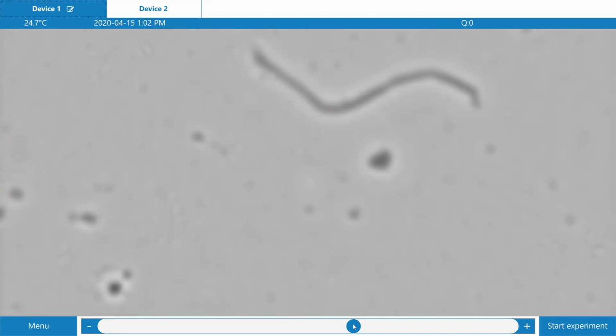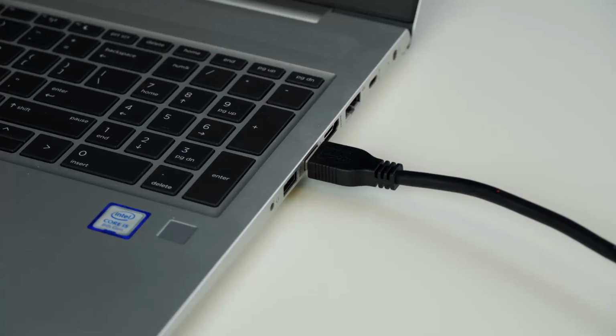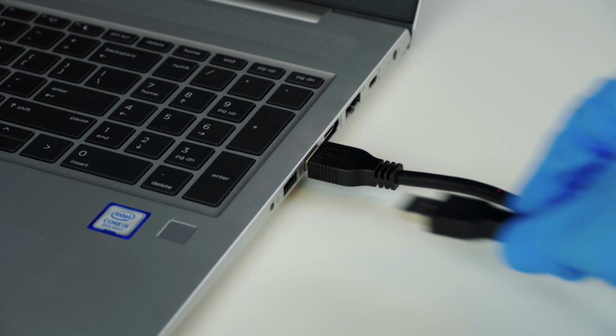Finding the right focus for your sample can be done in the application interface and does not require any manual manipulation inside the incubator. Now repeat to connect and focus the second device.